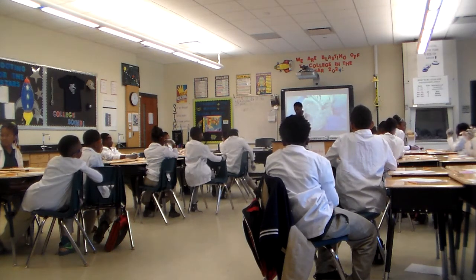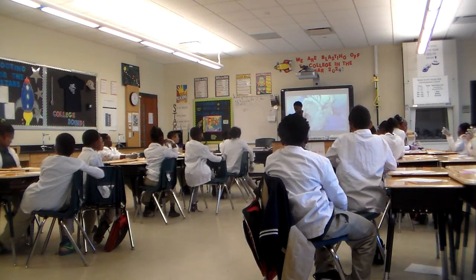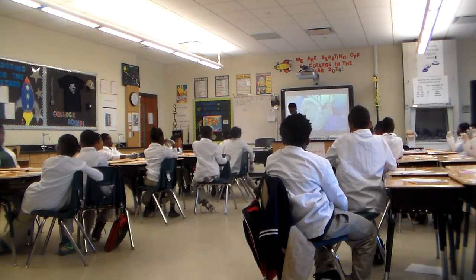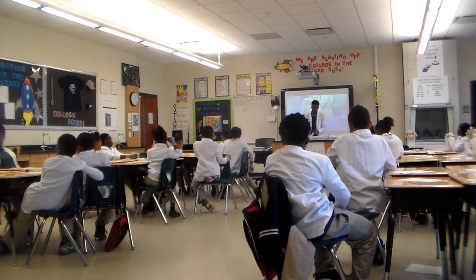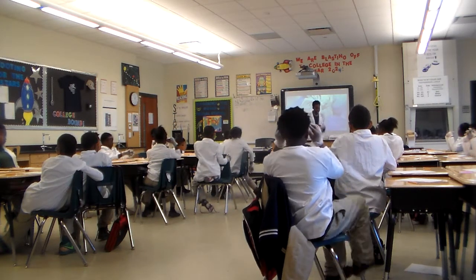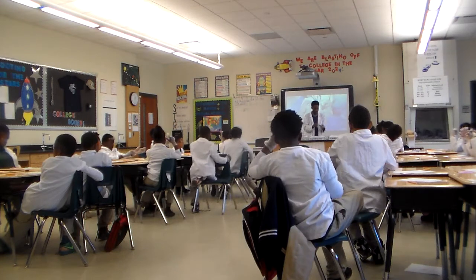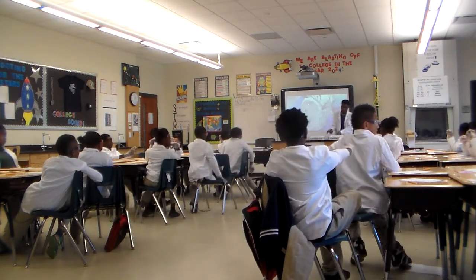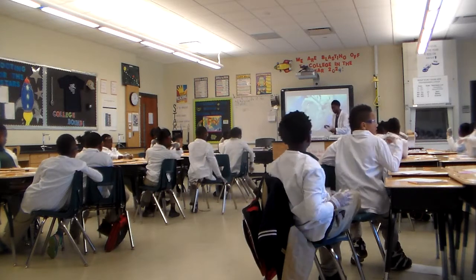I'm going to dispose of the liquid right here in the sink. And just a heads up, they have a very, very strong odor, right? So Lawson almost forgot. I should probably put on my what? Gloves! Yeah, just like you guys have on gloves. I should probably put on mine. I'm a teacher. Yeah, I don't have blue gloves today. That's fine.